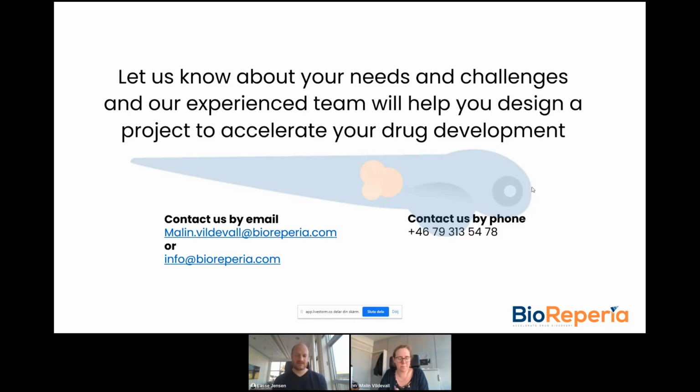Yes, so indeed, we have demonstrated, and I showed you some images of how tumor infiltrating lymphocytes indeed can be seen both within the primary tumor and associated with the tumor cells in the metastatic niches. So it is very much possible to study and quantify the amount of infiltrating lymphocytes and whether this can be augmented. You can have more lymphocytes infiltrating the tumor with certain treatments.